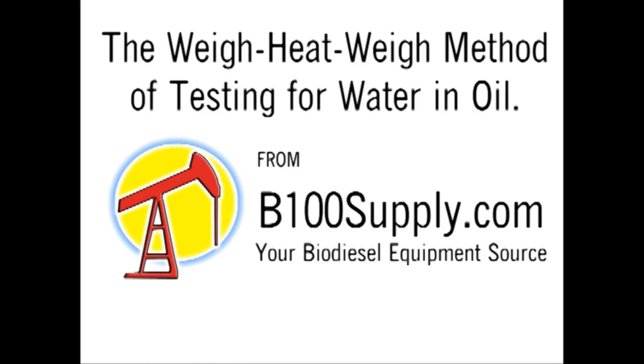Hello, this is Rick with B100 Supply. I'm going to show you the weigh-heat-weigh method of quantitatively testing for water in vegetable oil or biodiesel.